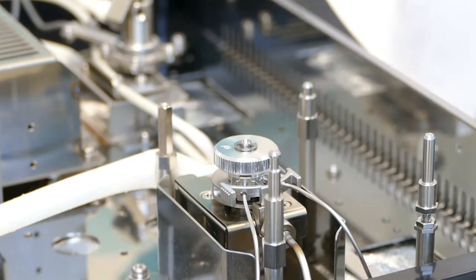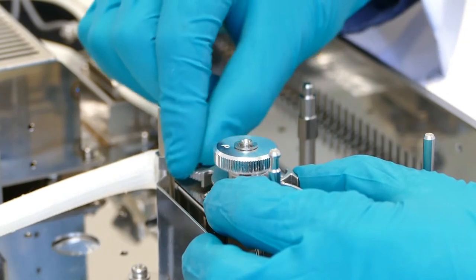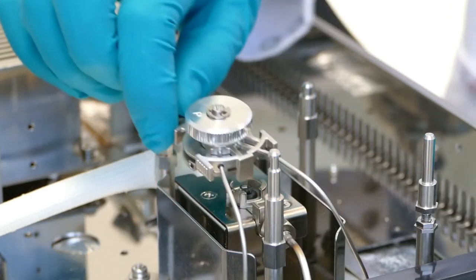The liner must also be changed regularly. The frequency of this depends on the sample matrix. However, a general guideline is to replace the liner every 200 injections.